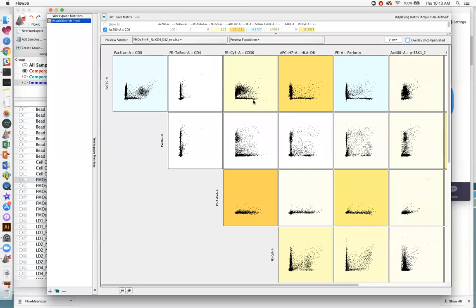the middle portion of the positive population roughly matches the middle portion of the negative population. Okay? On occasion, you'll see events that are crashing in towards the y-axis or maybe down towards the x-axis. Other times you might see a bend right in towards the center of the graph, either along the x or along the y-axis, and it's a fairly obvious bend or a very interesting sort of relationship.